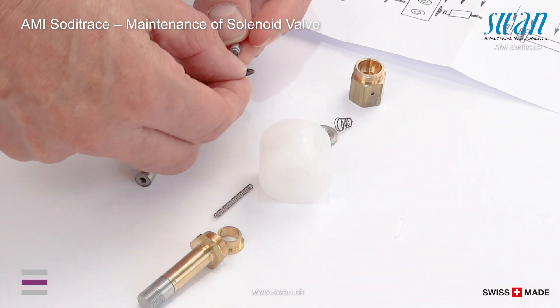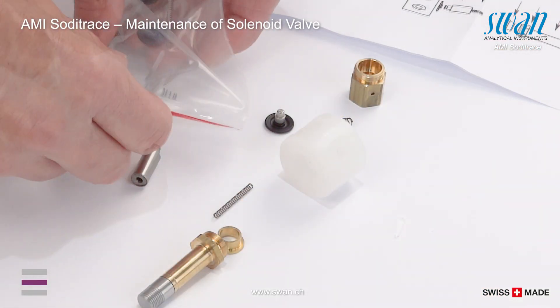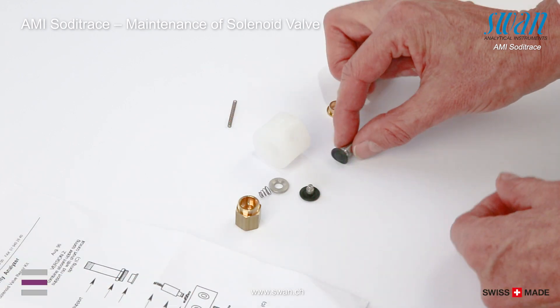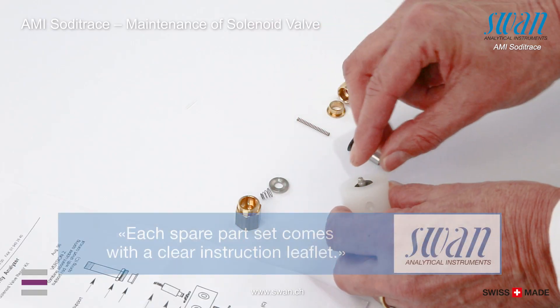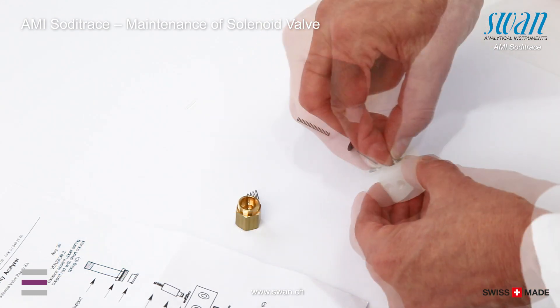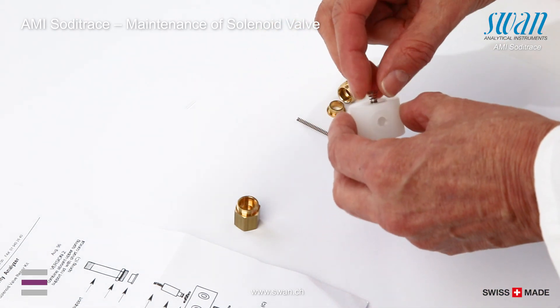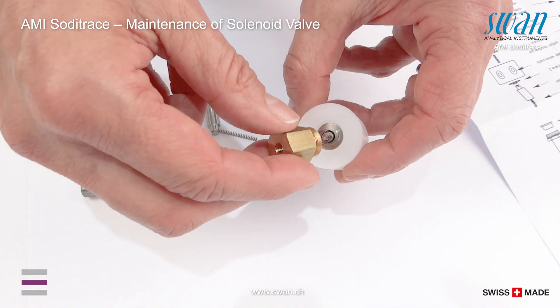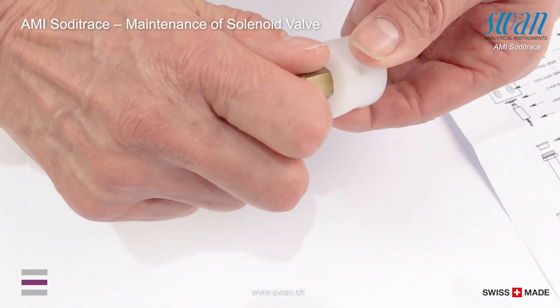Put new membranes on the membrane holders. Place membrane one with holder in the valve body. Place washer one on membrane and push down carefully. Place the conical spring with the smaller end on the membrane holder. Fix the bottom screw finger tightly.